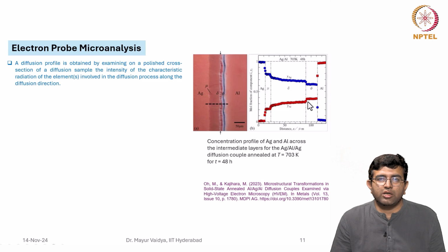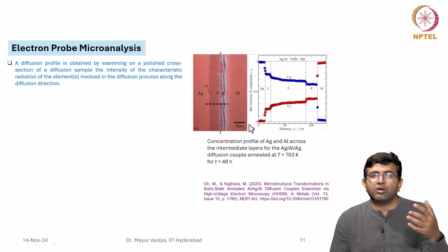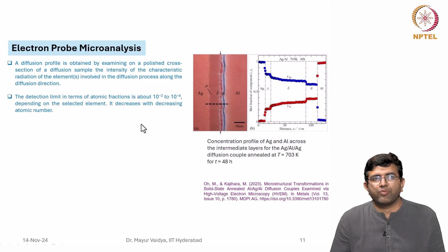And as we saw in several examples in the week where we did the interdiffusion lectures, you can see that, for example, this phi phase has a constant composition, which indicates to us that phi is an intermediate phase with a narrow composition range. Okay, so like this, here you have pure aluminum, here you have pure silver.